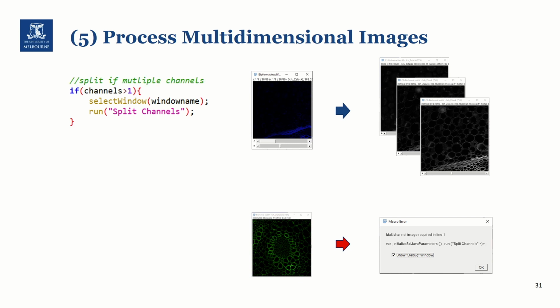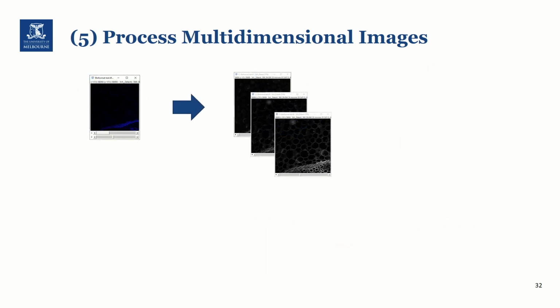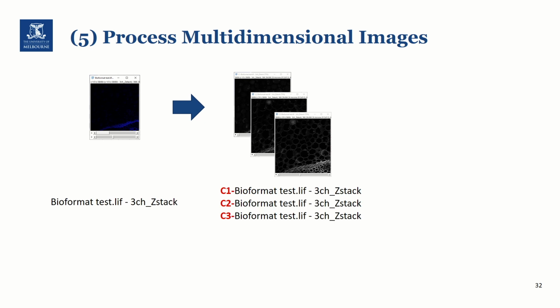So we need to set up a condition so that this runs only if it is a multi-channel image.